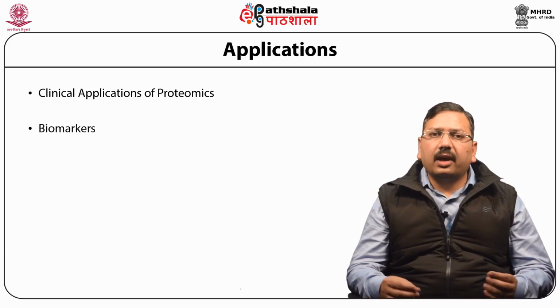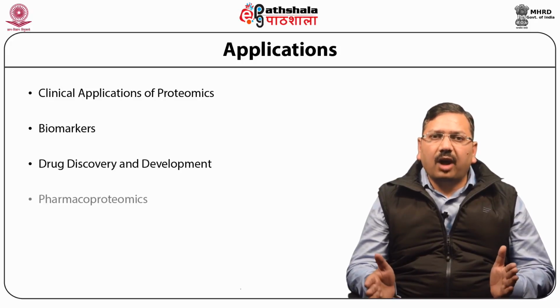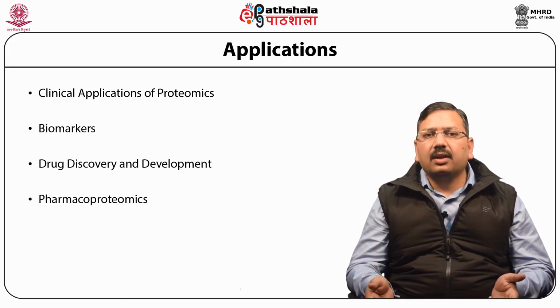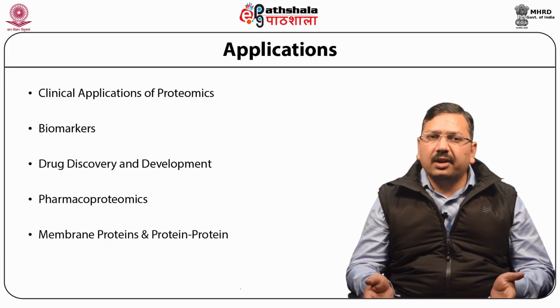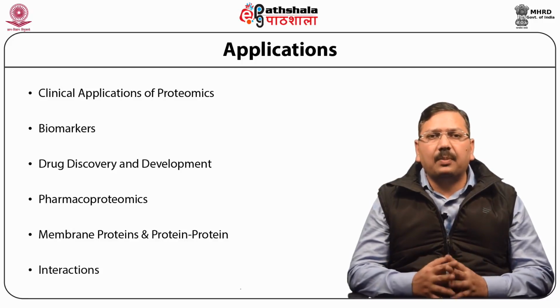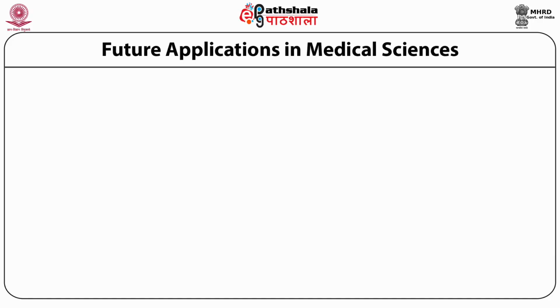Proteomics also has a direct relation with drug development and discovery programs. There is pharmacoproteomics also. And lastly, at the research level, people have found protein-protein interactions, and even membrane-protein interactions, as an application of proteomics.